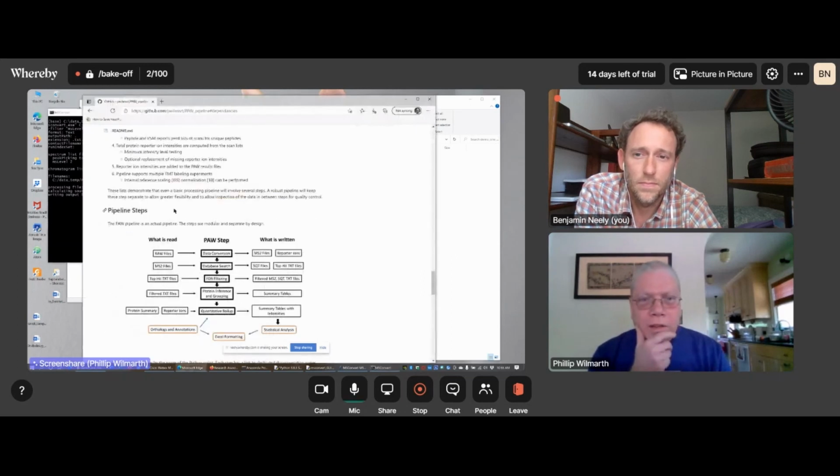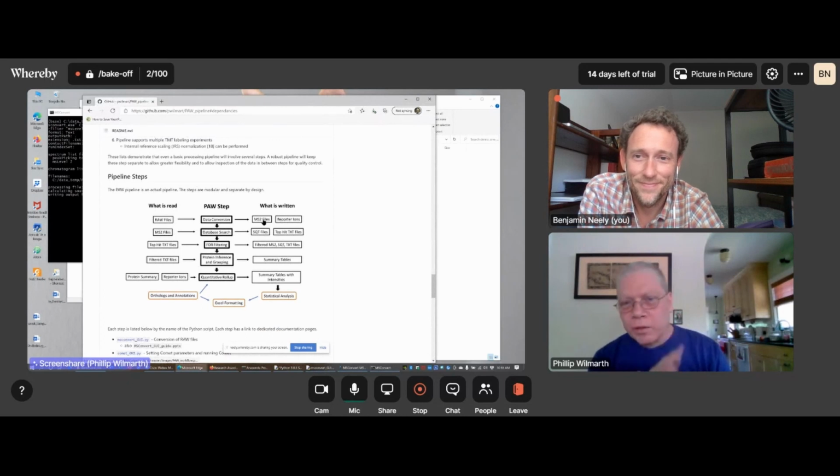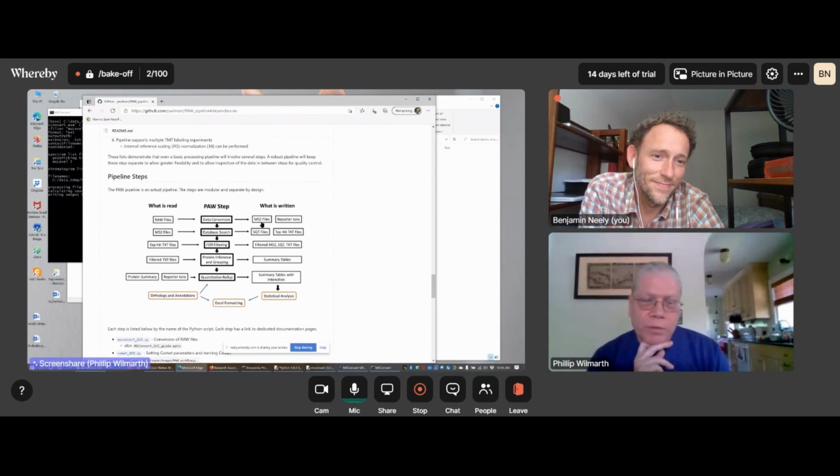So up here, we've got kind of a little diagram of what the pipeline steps are. So here we're reading the raw files with MS Convert, and we're producing MS2 files, which are sort of like the MGF files if you use Mascot. It's a file format developed by the Yates Lab back in 2003. It's just sort of a text version of the peak lists. And if we had TMT data, we would also get reporter ions.